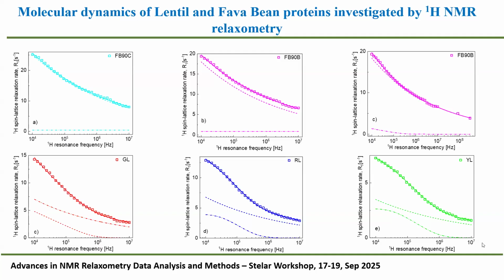And the other things, about tau and this, are things as we discussed in the morning. I think you were hearing us that first we have to start with a sample and try to optimize all the parameters, checking, doing measurements, increasing, decreasing different attenuation parameters, just to see what is the maximum value of these parameters, or the minimum value we have to use to get the maximum signal. And after that, we start playing with tau and all other things. Yeah, we will try to do this.